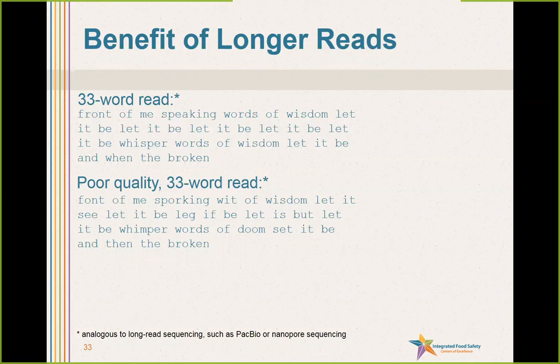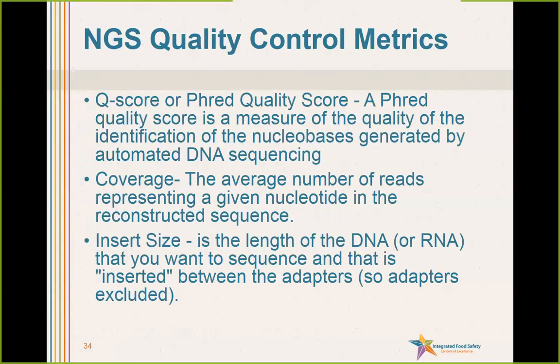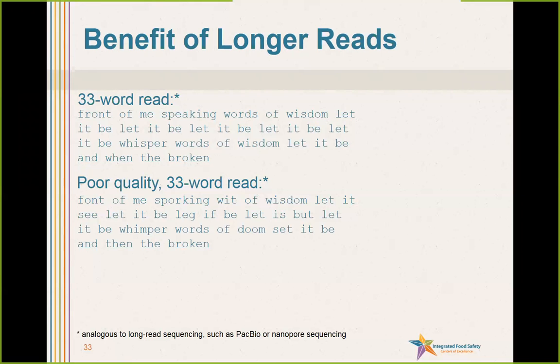This is where the PacBio machinery might come in. For example, take a rare Salmonella. I recently heard of Salmonella Livingstone. And you might not already have a good sequence run at this point for Salmonella Livingstone. You can use the PacBio platform to get better coverage, and you can use that to get a genome as a reference against Illumina runs where you can call SNPs. The benefit of long reads is you get the order correct.